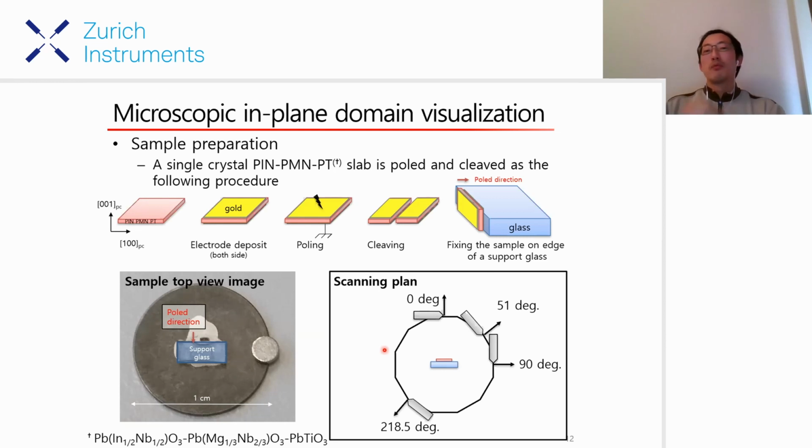And here, since we have to maintain the same calibration condition, the cantilever should not be changed when you change the sample orientation. So that is quite tricky. All cantilevers or probes have their lifetime, and we are spending some time mostly not getting the actual data set, but going back to the original place.